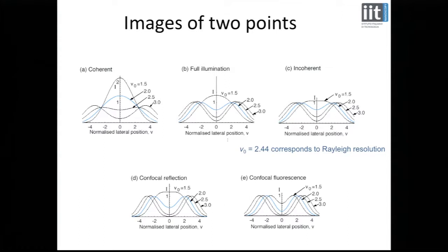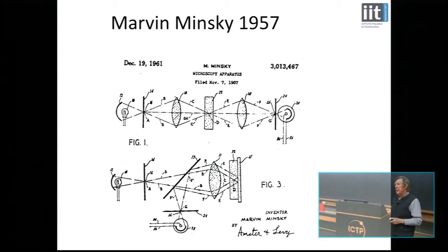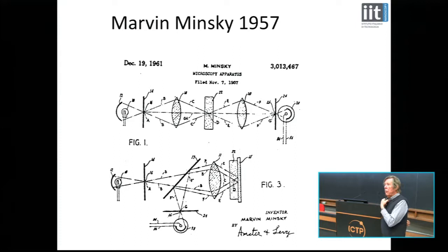Okay, now I was going to jump back and talk a bit about the history of how confocal microscopes were introduced and so on. Usually we recognize that the confocal microscope was invented by Marvin Minsky. Some of you might know the name of Marvin Minsky. Unfortunately, he died last year, 2016. But he was very famous in the area of artificial intelligence, mainly.